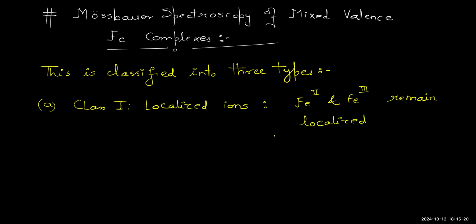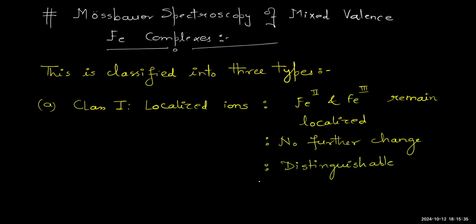No further change will happen, and hence in the Mossbauer spectra, these both are distinguishable. Right?